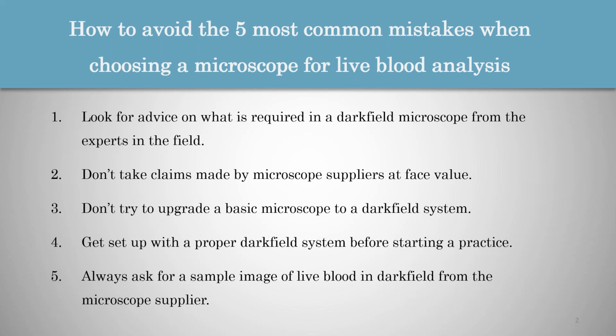If it's also sold as a darkfield live blood analysis microscope, and the image does not really compare well with what we're expecting to see in live blood samples, then of course that shows that the system is not suitable. And also if you actually get an image that does look suitable, and the microscope then, when you receive it, doesn't actually produce that image, then also as a buyer you at least have some recourse, which is not the case at all if you simply buy a microscope in good faith.